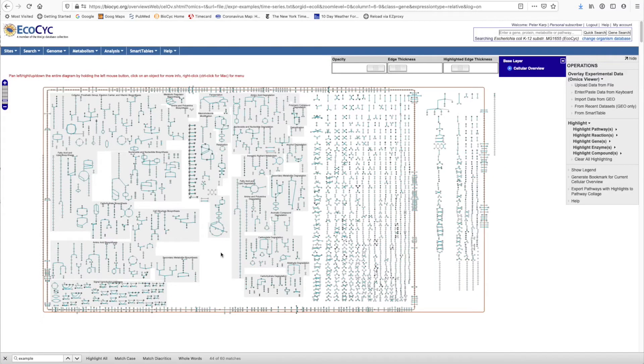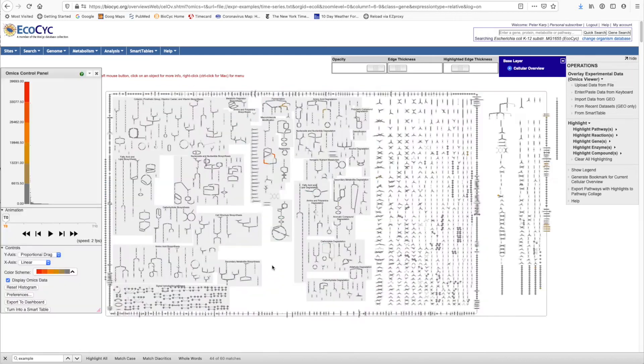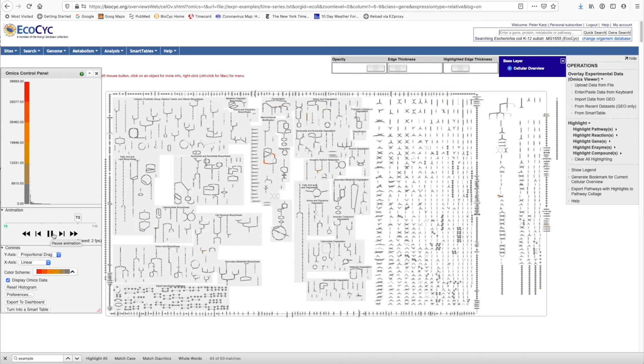We're now going to look at the next omics data analysis tool, which is painting omics data onto the cellular overview metabolic map diagram for E. coli. Here we see the E. coli metabolic map diagram painted with this omics data set. And this diagram is animated so that we can change the painting over each of the time points of the data set.